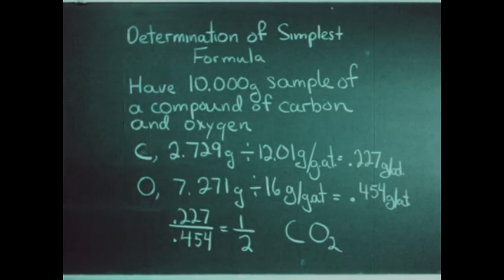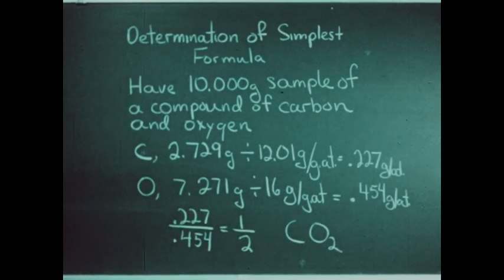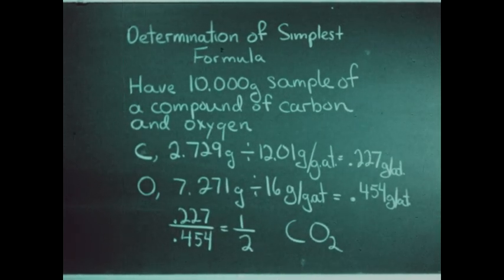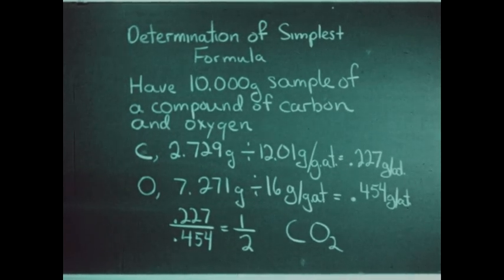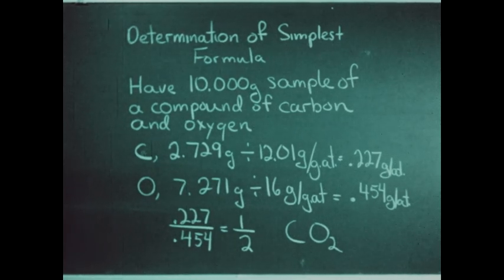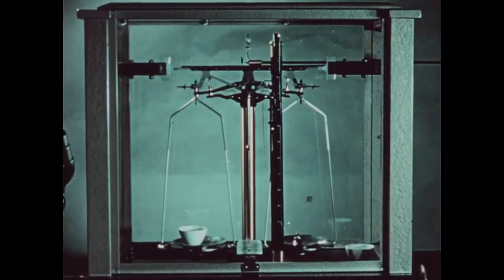In this film, we're going to examine the compound formed by copper and sulfur. We're going to determine the combining weight ratio experimentally, consult our atomic weight chart to get the atomic weights of these two elements, and then perform a similar calculation to determine the simplest formula of the compound of copper and sulfur. Bear in mind that the two required items are the weight ratio in which the elements combine and the atomic weight of the elements.